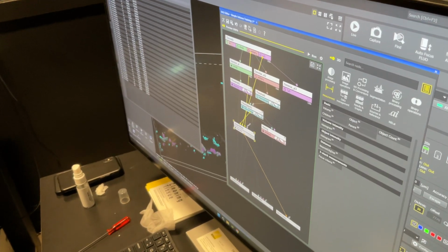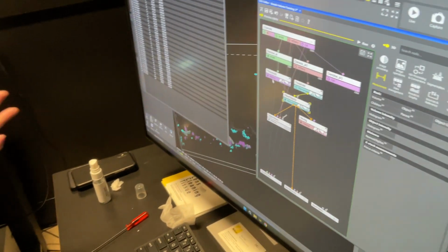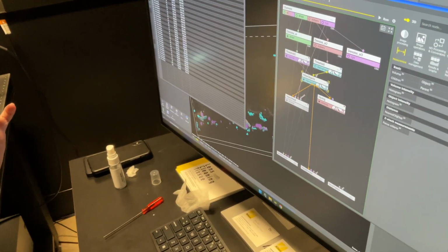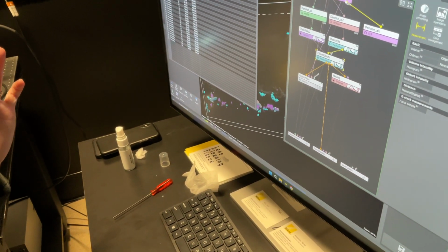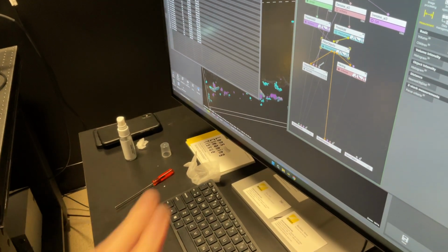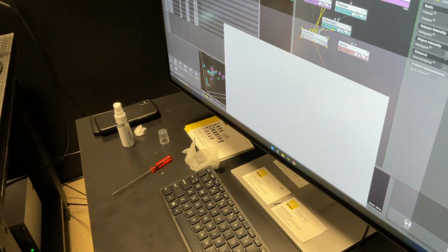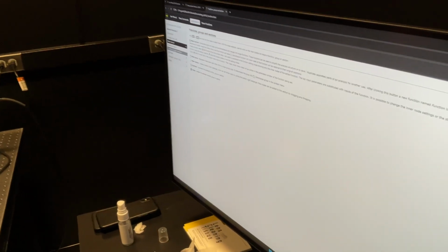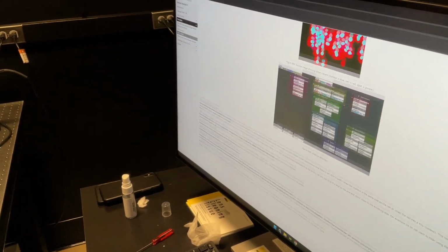What's happening is, let's say you got the bacteria. That's a smaller subset, a smaller area. You can tell it to measure this intensity on this layer, and it just looks through that little spot. Going through this was helpful though. It got some of the basics, and there are basic control examples that show you how to do some of these things.